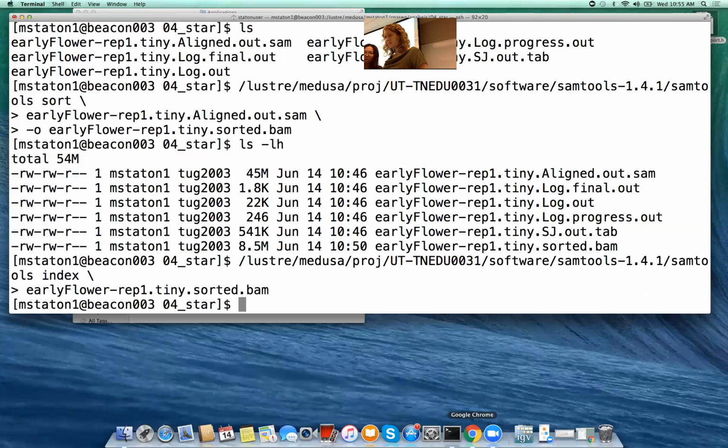EPP531-RNASeq-2017. You get an error message when you load the BAM file. It asks for an index file. We are getting an error message, and we did not get an error message last week when we were testing the materials. So it might take me a while to figure out what's going on here. But yeah, this is a location where there should be a read, and there's no read. I don't know why.